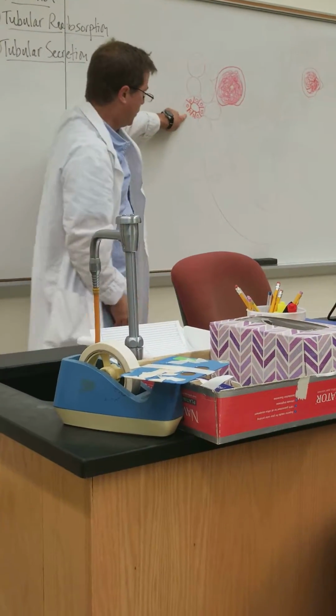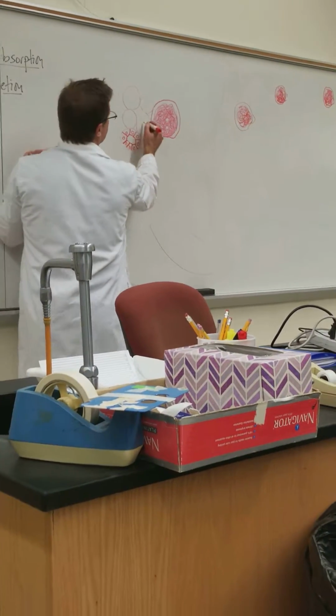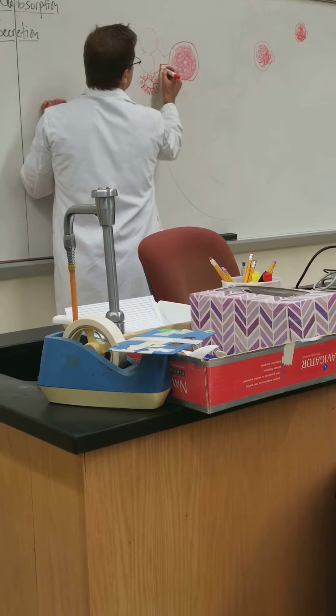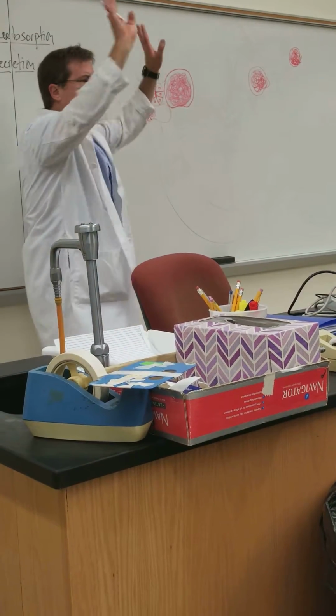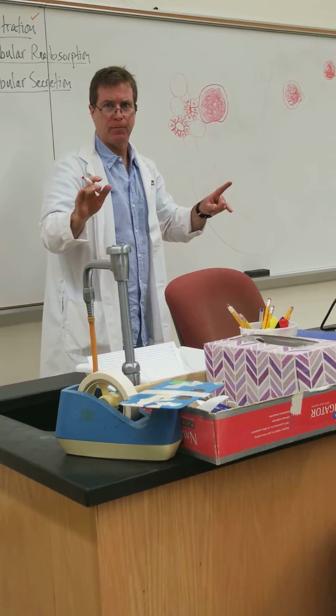There's the kidney tubule. Sometimes they're so squished that the donut hole is kind of squished itself. It just looks like this. And we can see those big cuboidal cells like this, and the nuclei inside of them. That's everything around the glomerulus: kidney tubules, renal tubules.